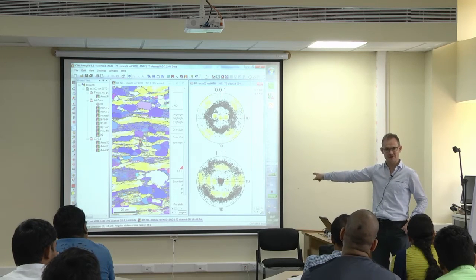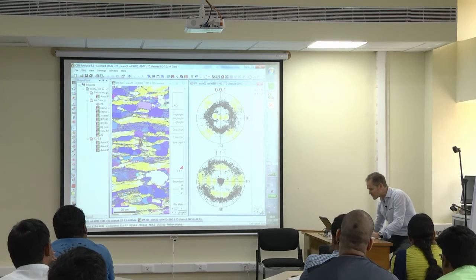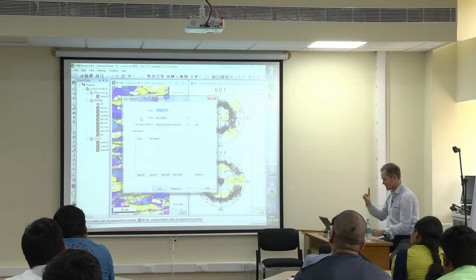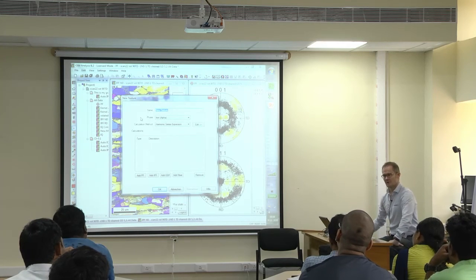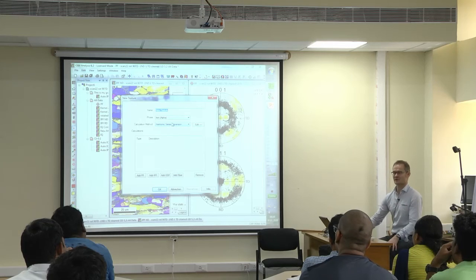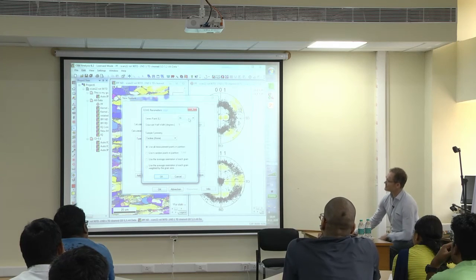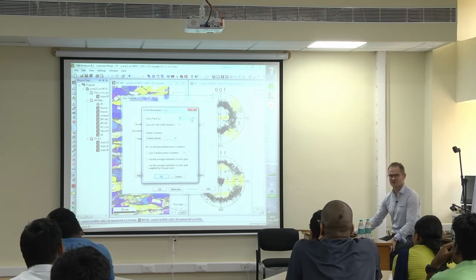And you just hit the button for texture. Maybe one example shortly to finish that. If you want to calculate the texture, then you say new texture, and now comes up all things which you have learned from me, or you haven't, but you have at least heard from me. And that is, first you have the selection of harmonic series expansion, and you say, yes, this is what I want. Edit this. You see, I can select the rank, expansion rank, yeah, 16 is default.